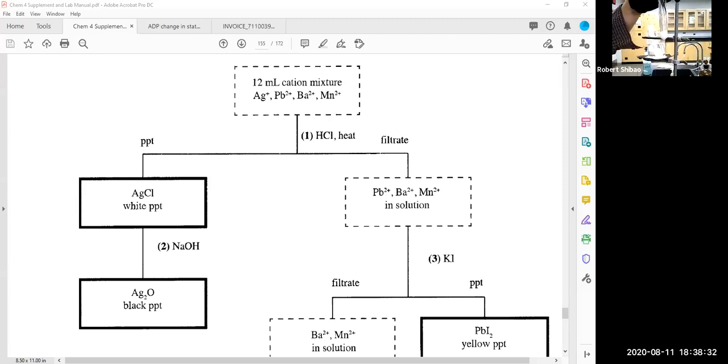Okay, so I have this. I'm going to filter this one out and see what we get. I think I accidentally spilled some water in that one. Grab my funnel. I'm going to analyze this further, so I'm actually going to wash the funnel with some soap and water.